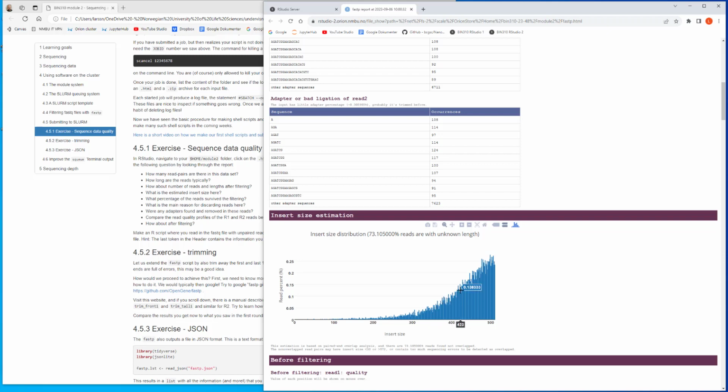Now we know the reads are 300 bases long. If the fragment that we sequenced was 500 bases long, the two reads will overlap each other. 300 from one end, 300 from the other end, right? That will make an overlap of 100 bases in the middle.